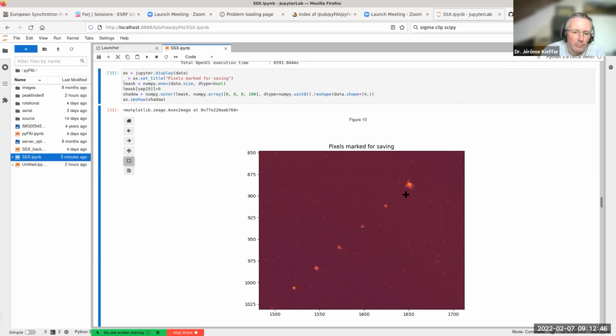I did some benchmark initially on the pedestal correction for the GPU, and we arrived exactly at the same conclusion as Philip from PSI. I guess you know him, which states basically that we need chunks that are large enough so that the reading of the pedestal and gain values from the central memory is negligible compared to the number of frames we are processing.